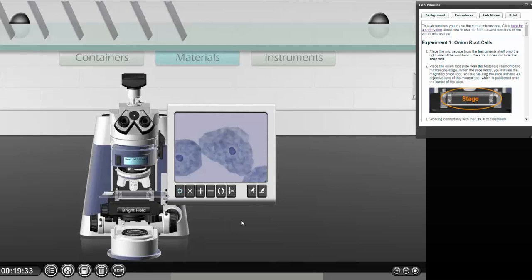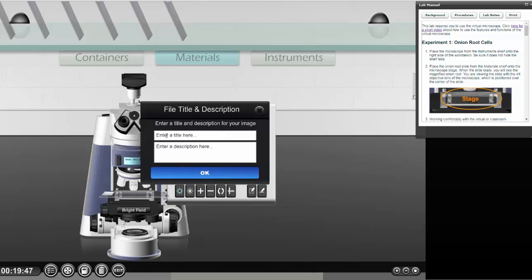Here's the good part. I'm not going to have you label it here because you end up with these little hands and dots and things that are already complicating a very small screen. So I'm going to have you save it first. So save it as a snapshot.